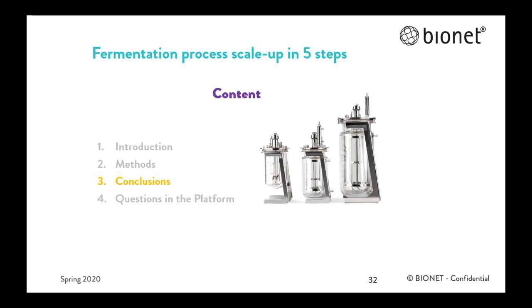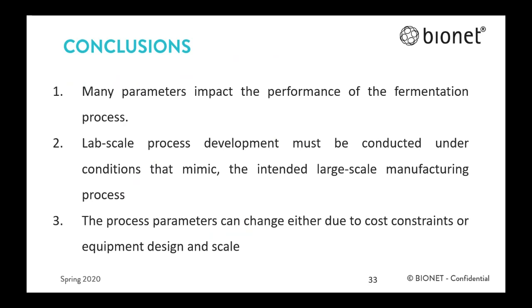And to finish, some conclusions. Many parameters impact the performance of the fermentation process, and most of these are subject to change during scale-up. Lab-scale process development must be conducted under conditions that mimic as closely as possible the intended large-scale manufacturing process.